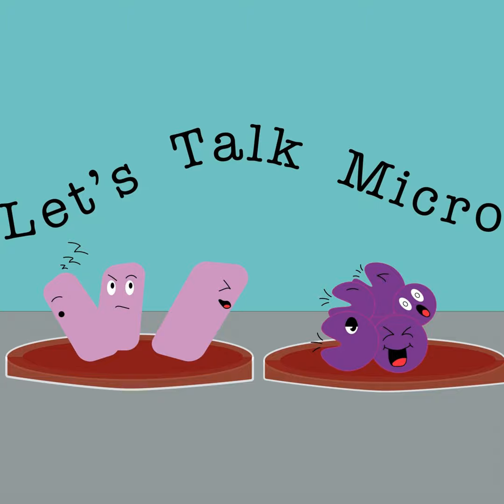Sure. So Oxford Nanopore Technologies is a company, I believe based in the UK. They have a novel technology of DNA or RNA sequencing that provides data in a fast, accessible, and easy to use way. They're mostly involved in, I believe, research environments, but they have started to expand into other fields like environmental education and, of course, healthcare in a research use only format.